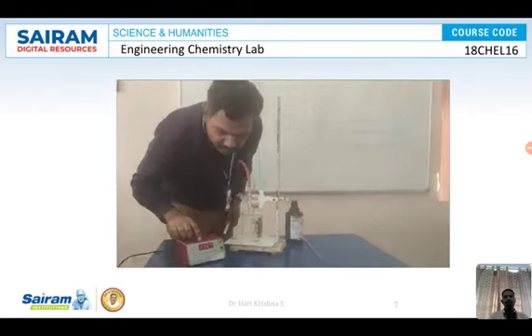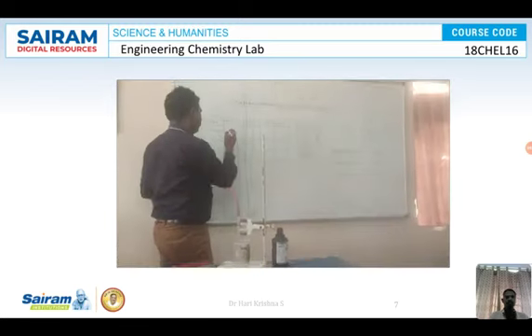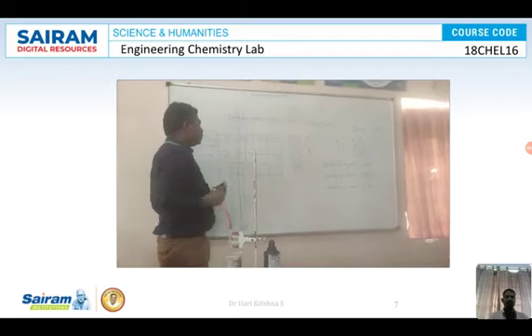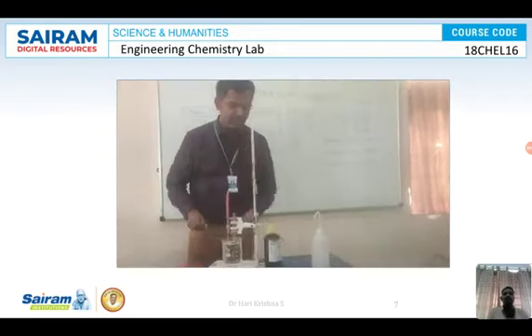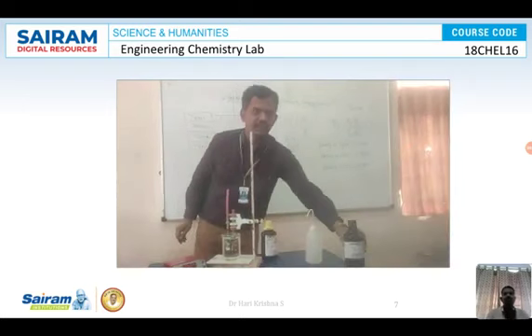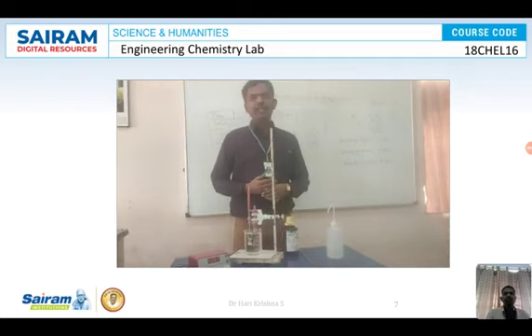So it has 110.7. That is the liquid. 110.7. So we are going to repeat, 110.7 seconds, for the liquid similarly. So we have done with the liquid.